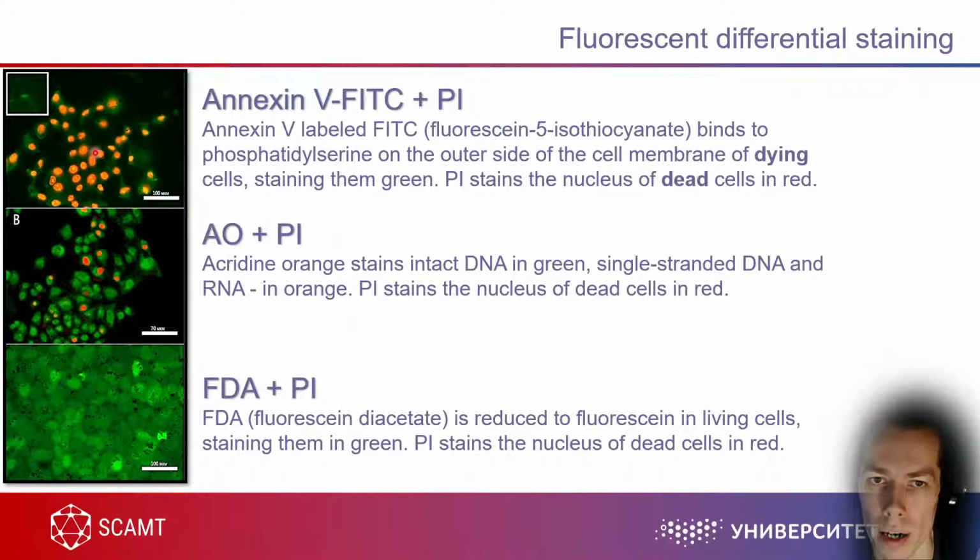They already have some permeability of membranes, but still they're in the middle of the cell death cycle. And if you have cells only with a red nucleus without any green fluorescence, it's the last stage of cell death, or maybe it's just a necrosis type. Death with the features of necrosis, to be correct.